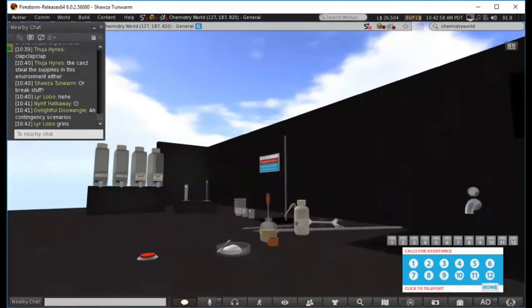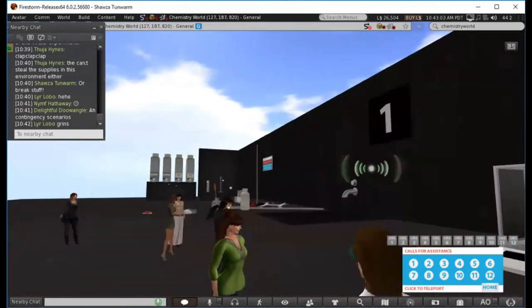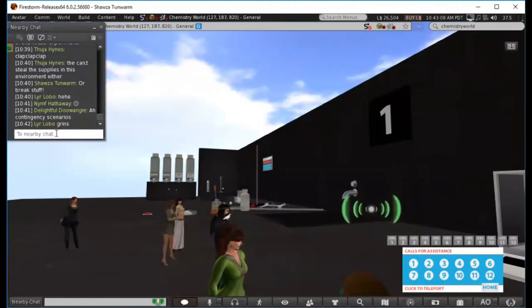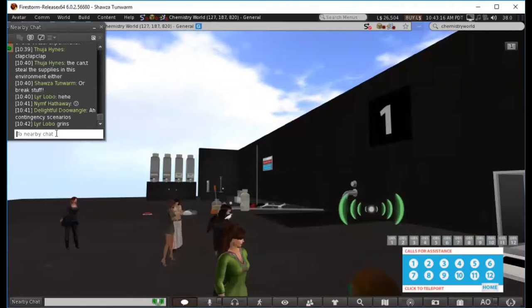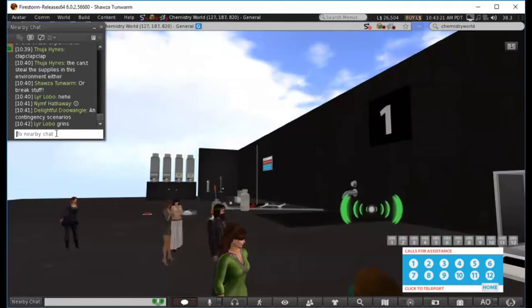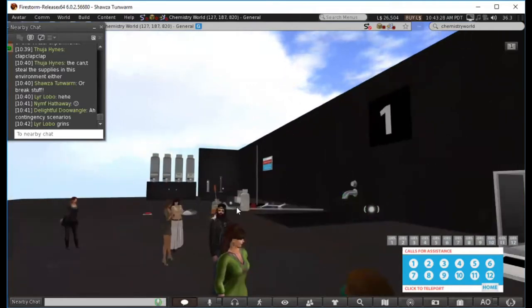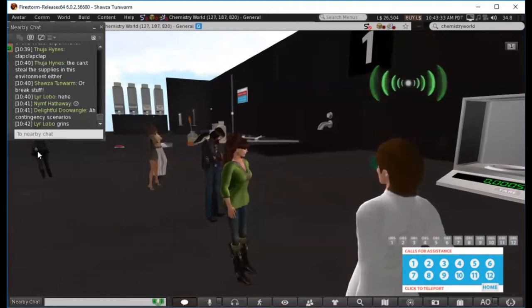They need 10 milliliters of water, but they're dispensed 10.5 milliliters. Well, now they have to remove 0.5 milliliters. Okay, they do that, but they accidentally remove 0.7 milliliters. Oh, now they have to add 0.2 milliliters. This is like a normal thing in the chemistry lab that you just put up with. And that was something we thought would be kind of a good learning experience for the students. So we incorporated that into the lab as well.